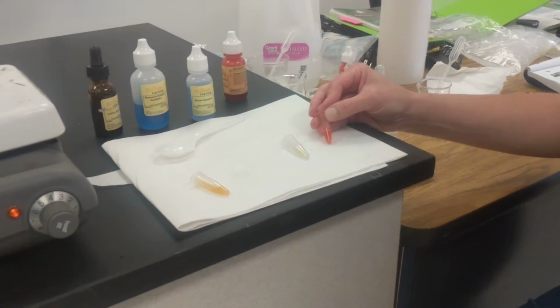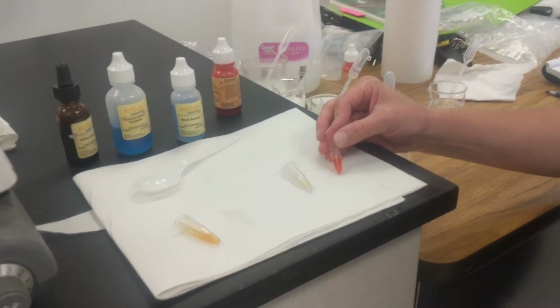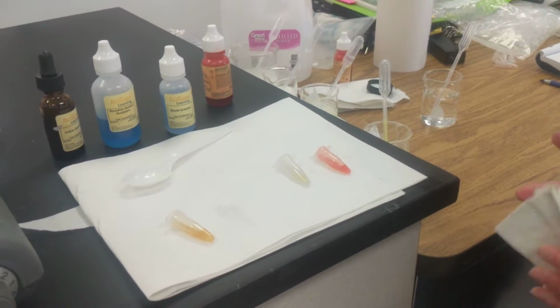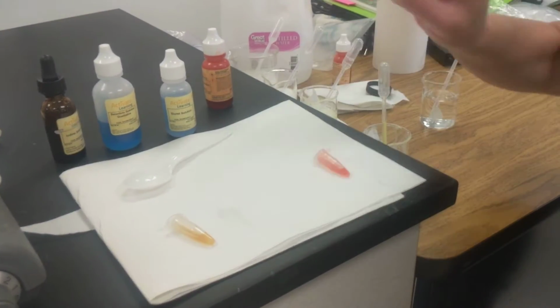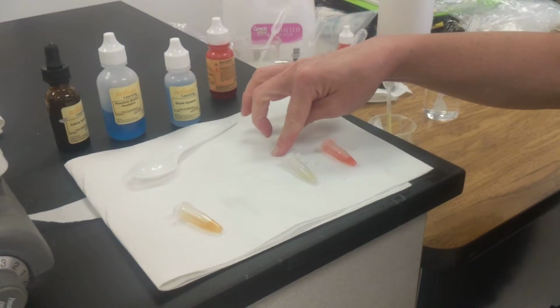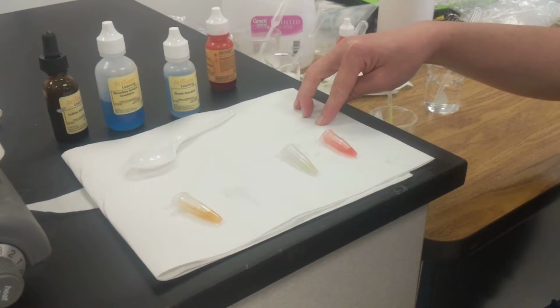All right, and I'm thinking that looks pretty bright red there. It's pretty good with the red. And let me shake this up one more time. Yeah. So that means there's fat in there too. No protein. There is fat, okay?